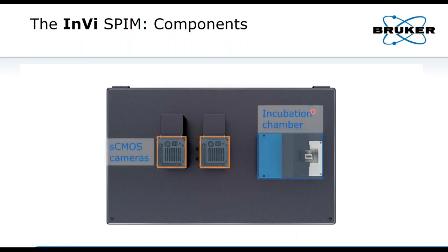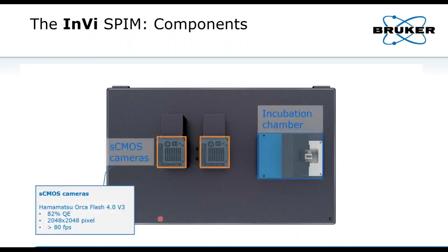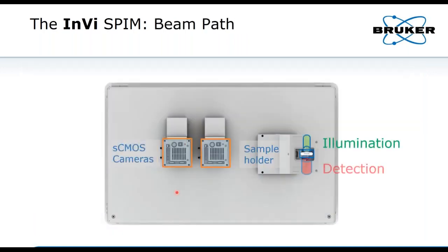This is the incubation chamber I mentioned already. We have again two CMOS cameras, in this case for two spectral channels. And then when we illuminate our sample, we detect it with a detection lens, and then we split the two channels by using a dichroic mirror. So this is a quite conventional approach using the same cameras. It's a single view, single illumination, single detection view, which is good enough for very transparent objects like mouse oocytes or smaller 3D or 2D cell culture.